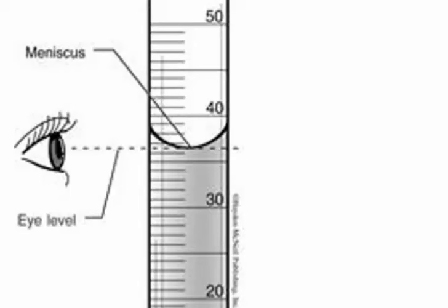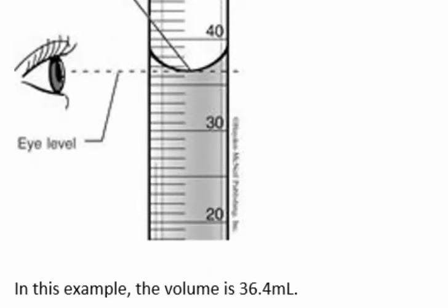An important feature when recording liquid volumes is to have your line of sight directly in line with the meniscus of the solution. In this example, the volume is 36.4 milliliters.